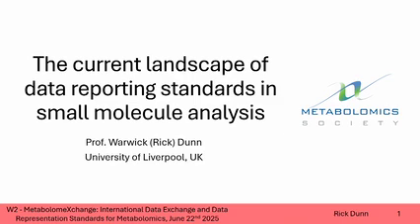I want to talk to you today about what the current landscape is in data reporting standards. Juan's talked about being able to submit the data and having that openly available. You need a layer of extra information within that to be able to understand and interpret that data as well. So that's what we mean by data reporting standards.